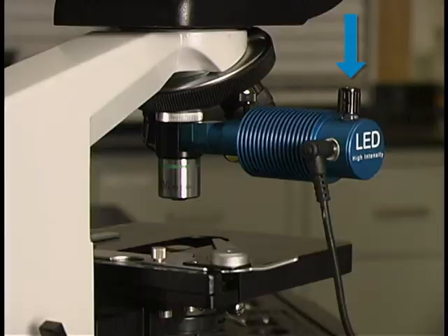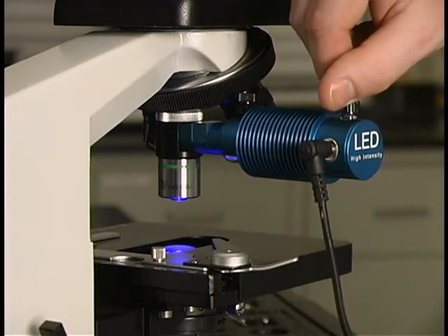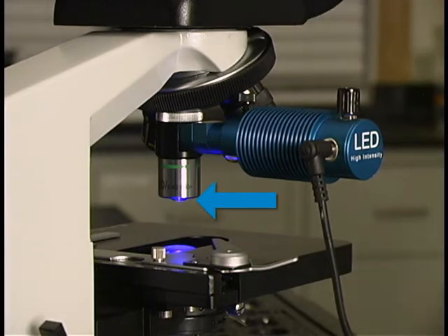Now the Paralens Advance is attached and ready to be turned on. Locate the black intensity knob on top of the LED light source and turn it in a clockwise direction. A light will emanate from your objective, indicating that the Paralens Advance is ready for use.